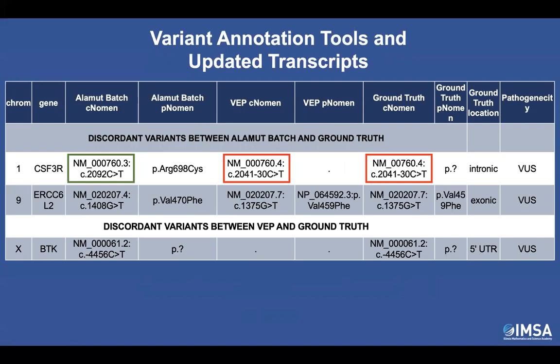So based on this data, it's evident that with respect to the HGVS nomenclature standards and clinical integrity, VEP has produced more accurate genetic annotations. So for the discordant variants, these differences were due to the various transcripts used by the software, which affected their genomic locations and thus produced discrepant results.